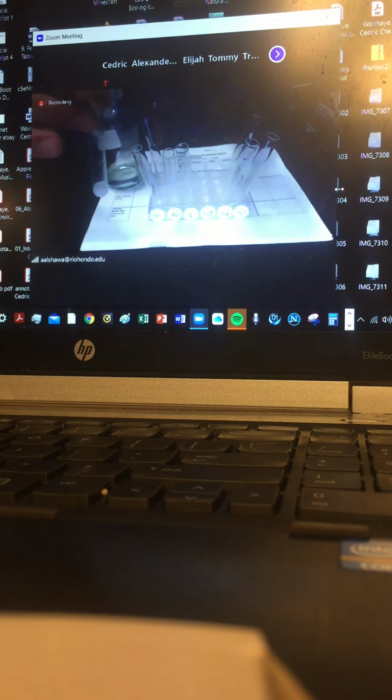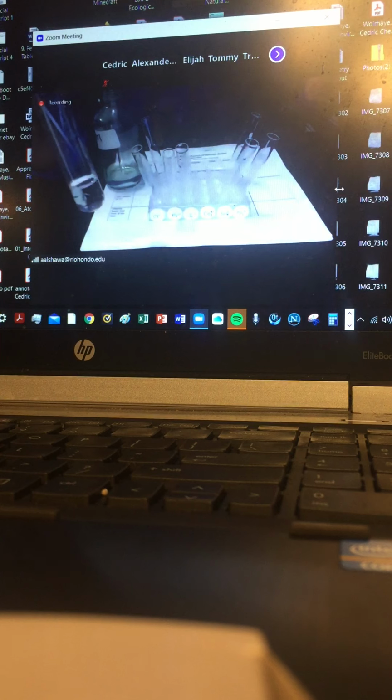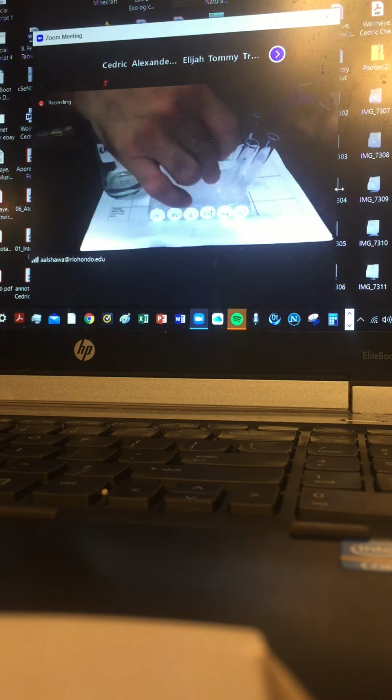So let me add acid. Okay, and now the solution cleared. That used to be the carbonate. Remember carbonate? I added barium chloride to it and I formed some solid. Upon acidifying that solution with 6 molar acid, it turns into a clear solution. So this is clear. The carbonate is gone.